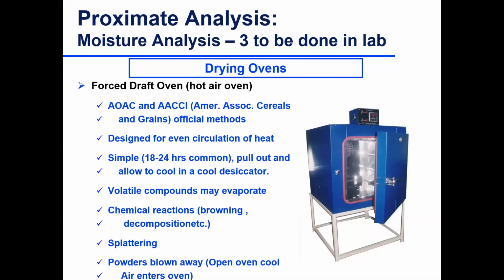So one approach, grouped into this methodology, drying ovens, other techniques, and so on. So we kind of lump them together. This is an official method using a hot air oven, drying oven. Well, this was AACC, American Association of Cereal Chemists, I believe. And so the name has actually been changed. The name has changed, but there are official methods. These approaches are approved for your labeling purposes, legal for that matter.